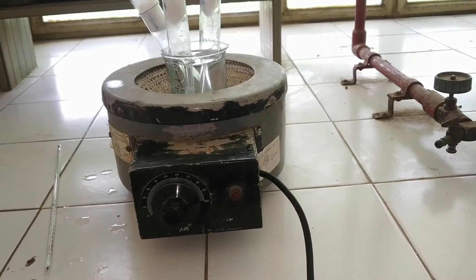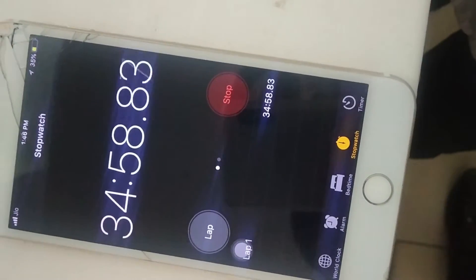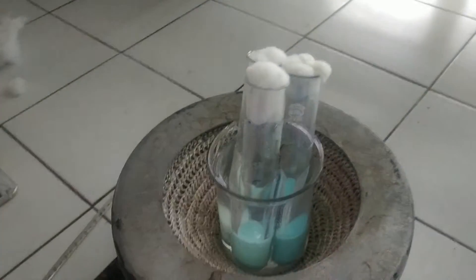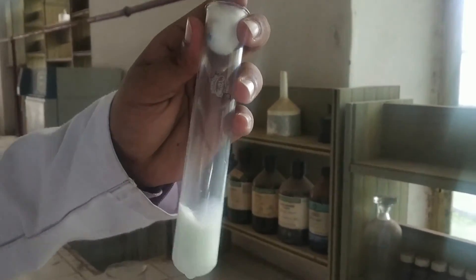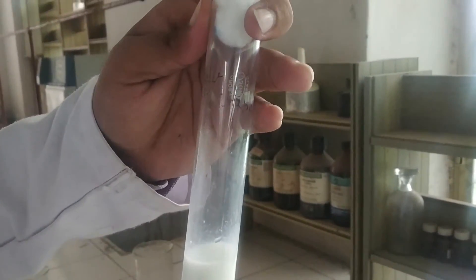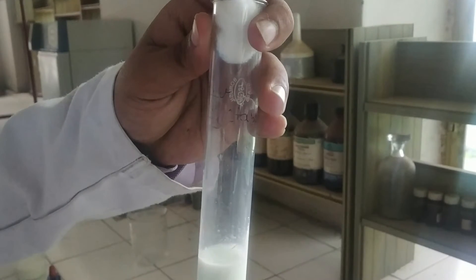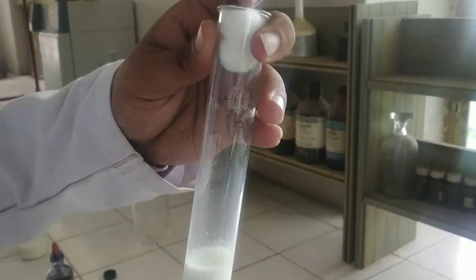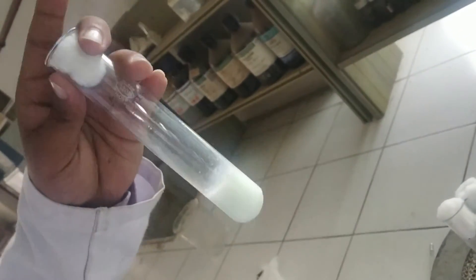It's 35 minutes now. We will check the color change with the samples. This is the raw milk sample — it has turned white in 30 to 35 minutes. This means the quality of this milk is very poor, as all the microbes present in this milk reduced the methylene blue color to white. So the raw milk sample is a very poor quality milk sample.